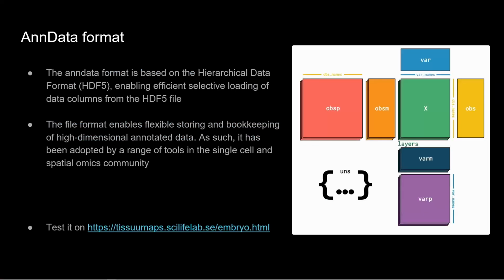But we can go a bit further because the format is already ordered in a way that we know it's actually an AnnData object. And AnnData format, it's an HDF5 file, but with very specific objects that we know about. So we have the gene matrix in the middle, we have observations for each different thing you have in the data, like clusters or number of counts and so on. You have the names of the genes in a different matrix and so on.